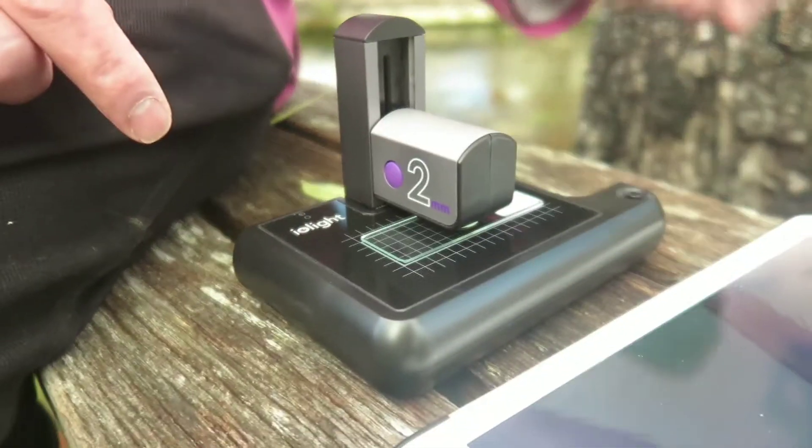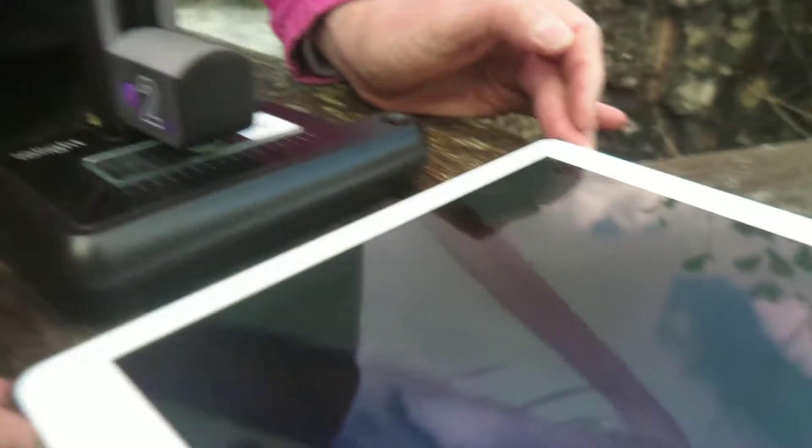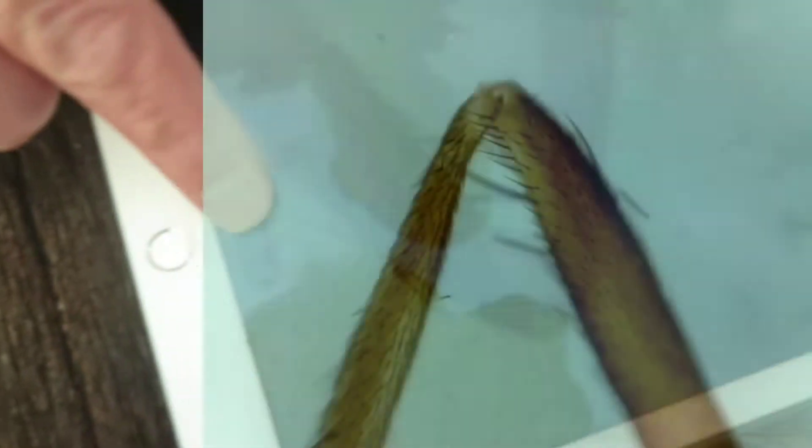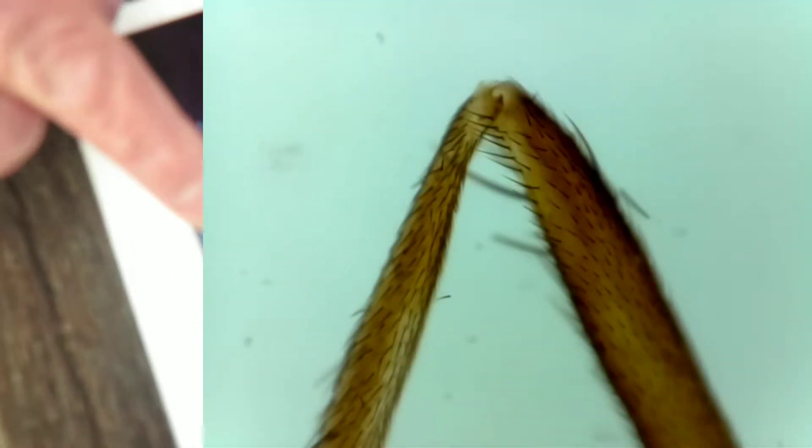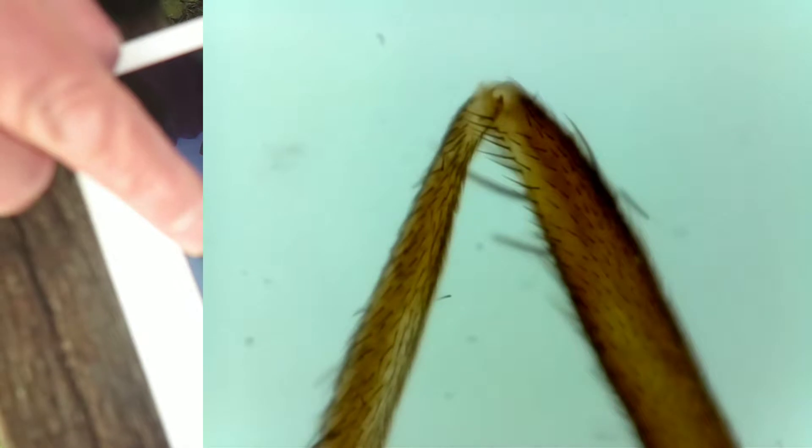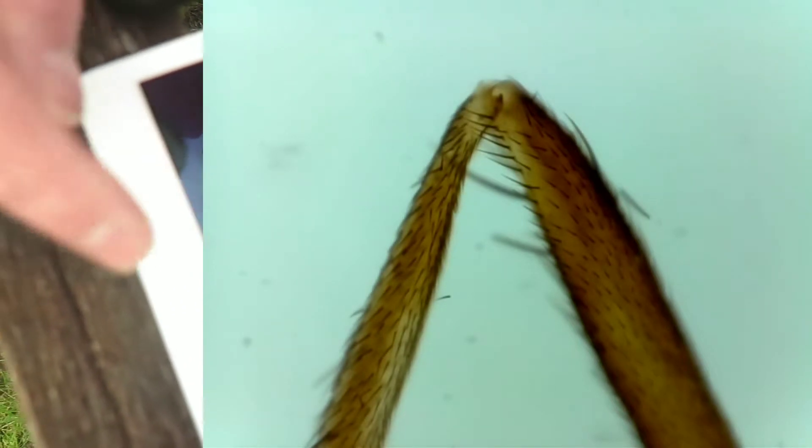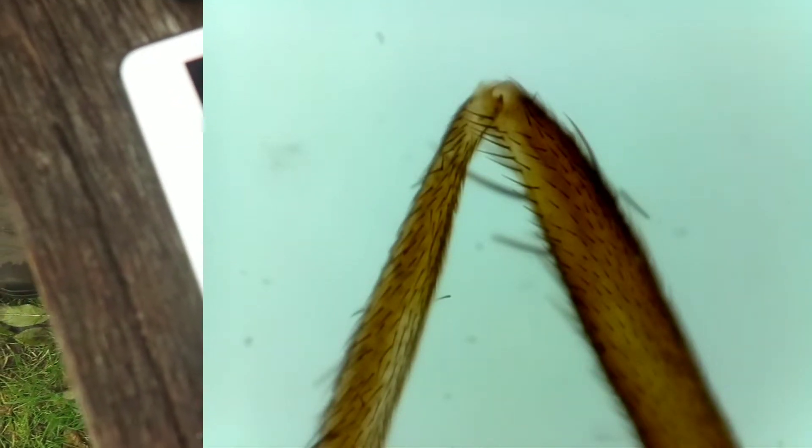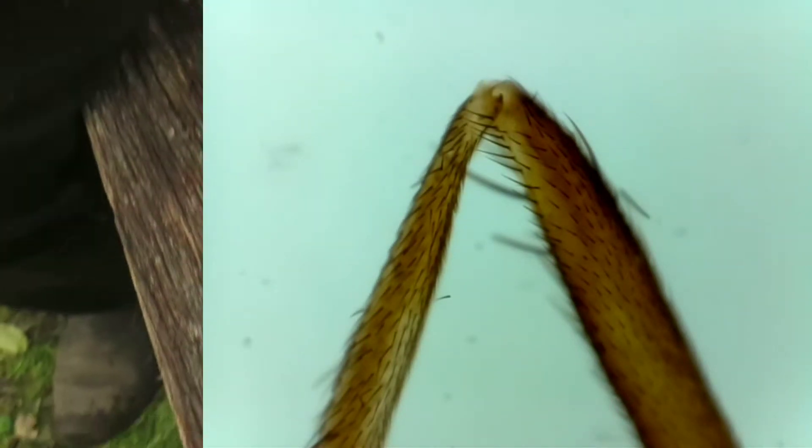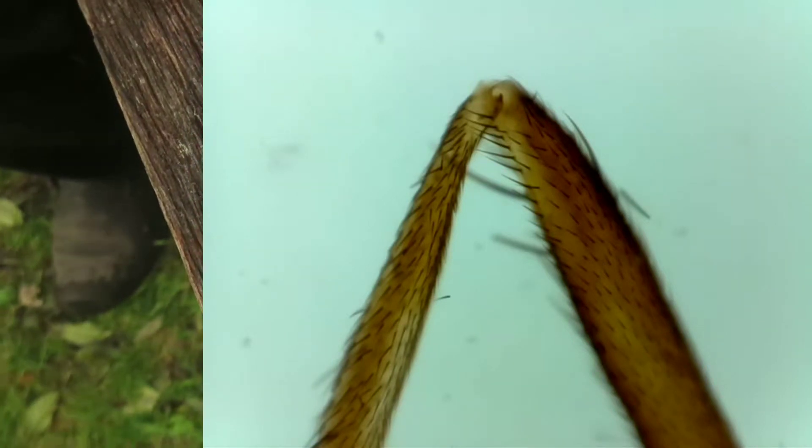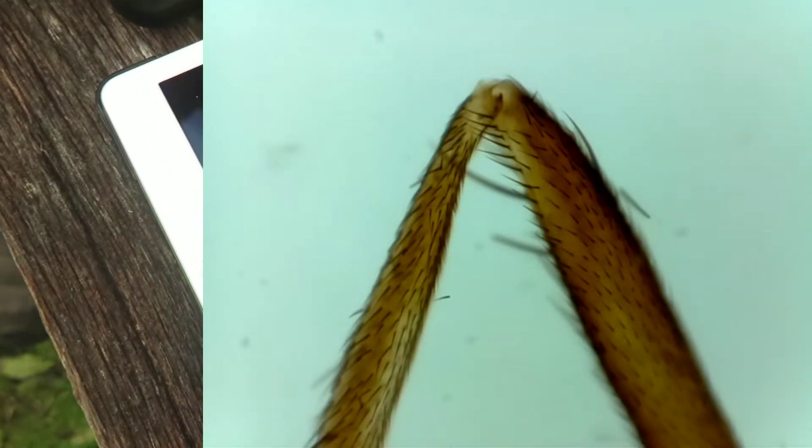Now you're nearly there so what we can do is we can now use the fine focus on the screen of the iPad and that will now get the focus to exactly where you want it. So by using those two techniques, the hand on the microscope and the finger on the iPad screen, you can get the perfect focus.